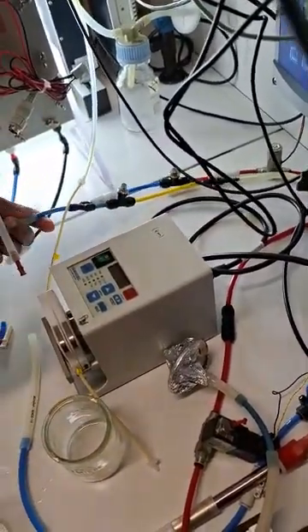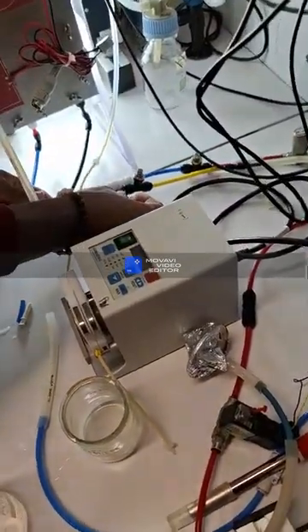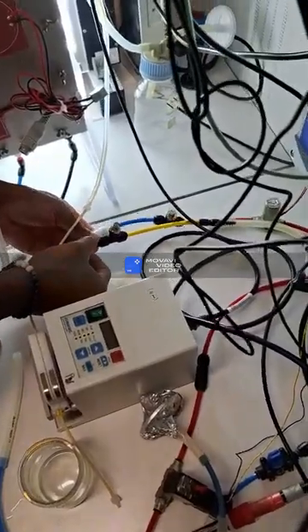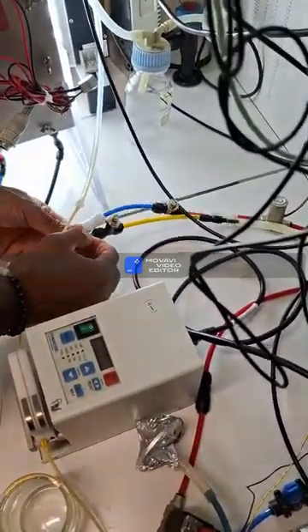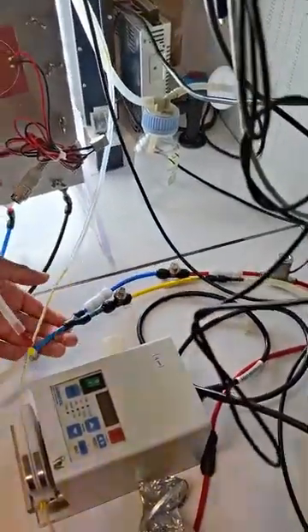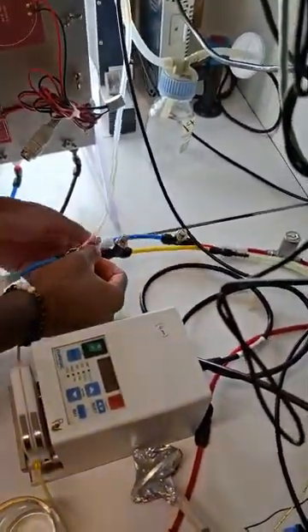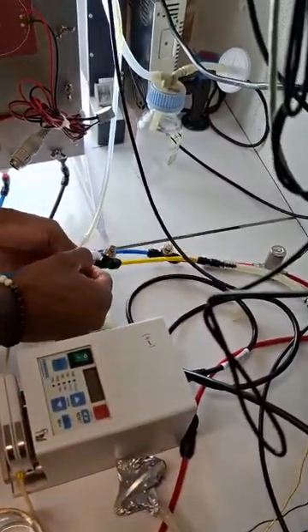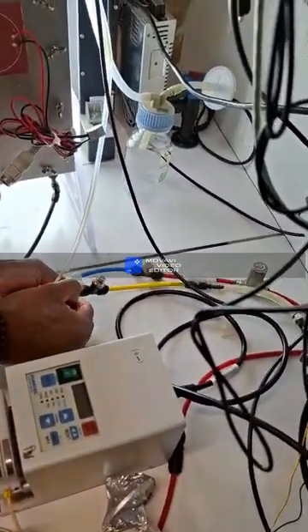And here we will maybe connect the T here. Yeah, I think it's better. What is our last step now? What are we going to do? Just install the air and remove the bubbles. Why do we want to do that? To homogenize the system.